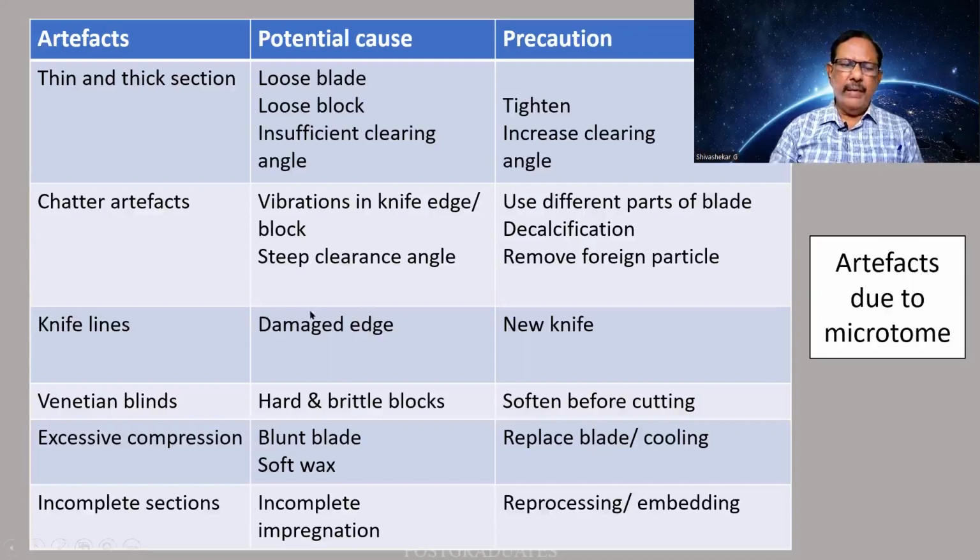Knife lines can be because of the damaged edges of the knife. Though we are having disposable blades, you should know that there can be artifacts because of it. In such a case, ask for a new knife or a new blade.